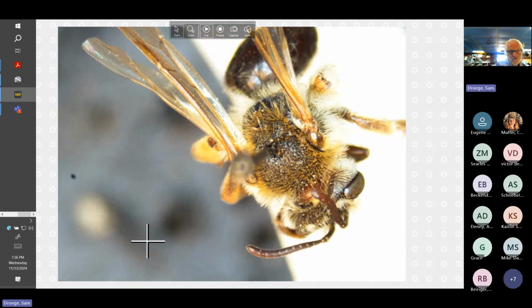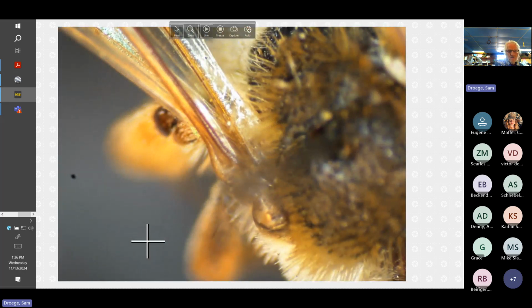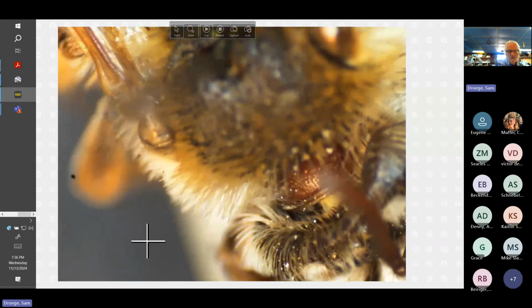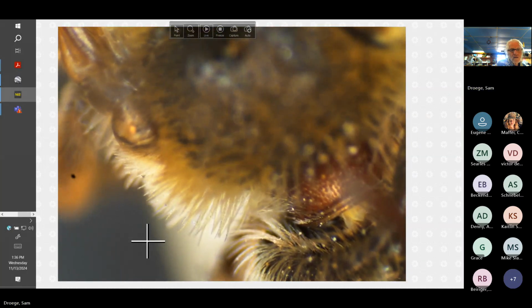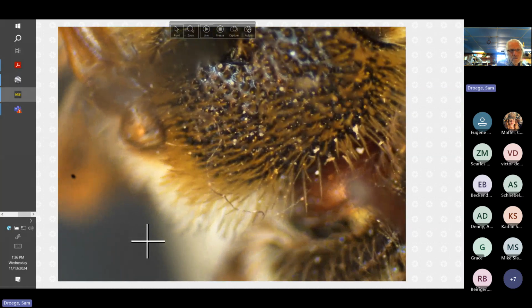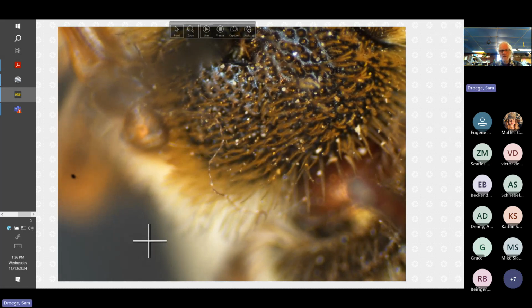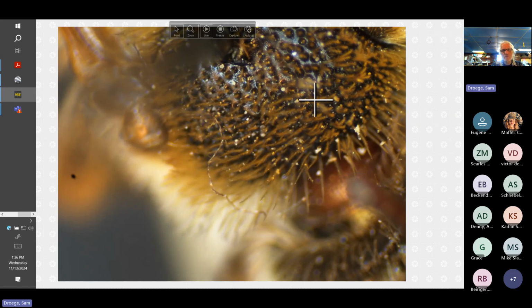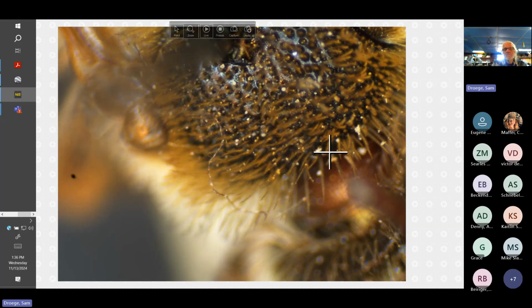Okay, now we're going to go for this notion of deep pits touching one another or nearly touching one another on the back. And there we go. So you can see that many of these pits, particularly as you get to the anterior edge, this happens in general, pitting increases and can pile up.